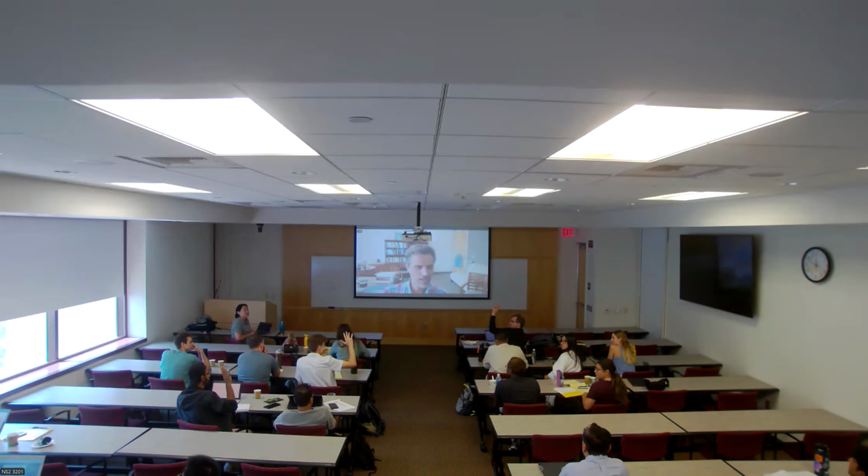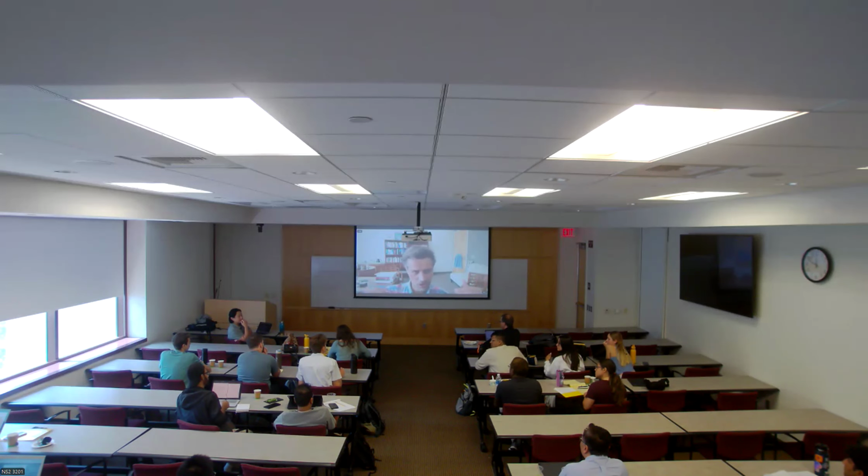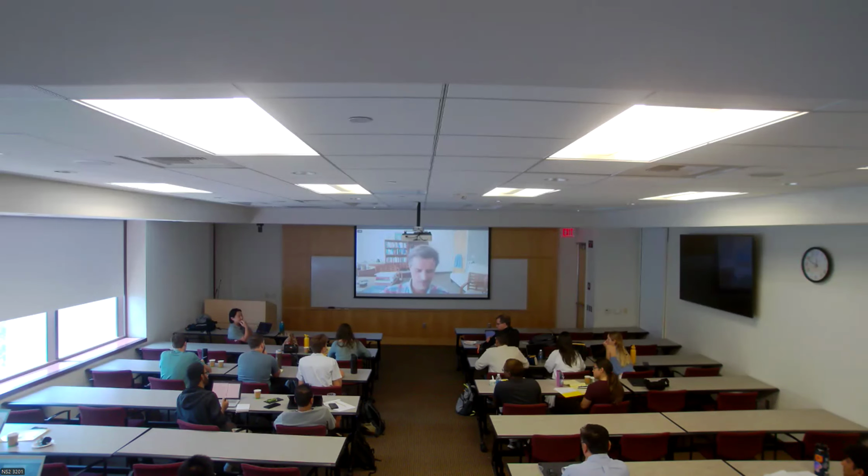Now, who of you actually are doing nonlinear optical microscopy? Anybody? I see two hands. Three hands, wow, okay. Now, what kind of techniques are you guys using? I'm using 2-photon excitation fluorescence, and I do a lot of FLIM imaging. Is penetration depth a limitation for you? Are you looking mostly at cell cultures or tissues? I'm doing tissue. So yeah, penetration depth is very important for us. Do you have a strategy for that? I'm figuring that out right now. All right, awesome. At the early stages.